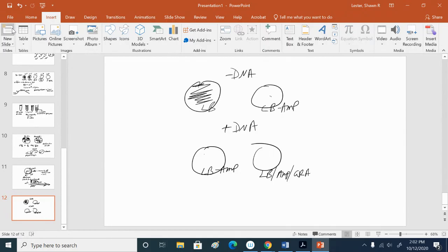And of course we had growth all over. Remember, these were green. So we have bacteria growing in the presence of ampicillin, and that means these bacteria are now ampicillin resistant. This plate here tells us transformation occurred.